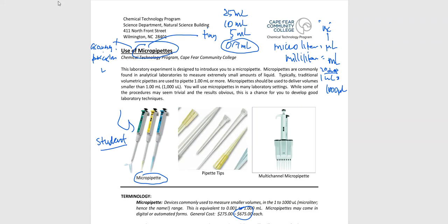Well, okay, then we will upgrade into luxury. Woo! So we've got really expensive micropipetters that are like Italian leather, cloth seats, power locks, rear view backup camera. Woohoo! I mean, we have them, but you're not going to use those in the very beginning, because cha-ching, money, money, money. I want to save some money if you're going to damage it, and that's why we let you use the old trashy basic ones first.